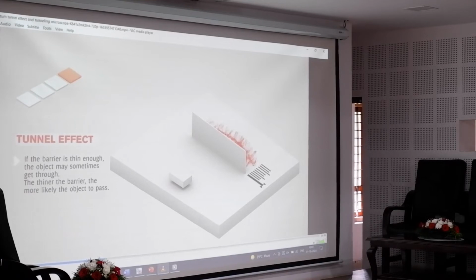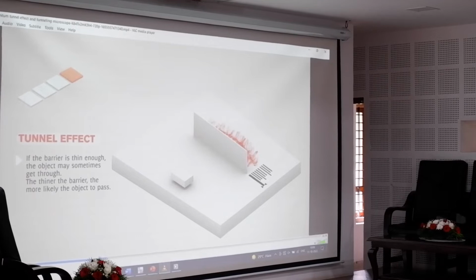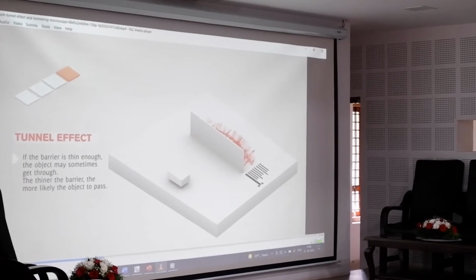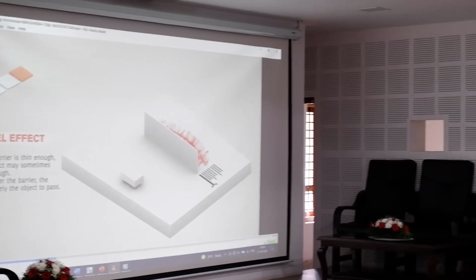Now, in STM, what is the barrier? That is basically the air gap. Which means that I have a tip, I have a surface. If I bring the tip closer and closer to the surface, what happens? The probability of electron jumping from tip to the surface or back, depending upon the polarity of the voltage, will exponentially increase. Okay. I am just going to show you 2 to 3 slides on the theory of tunneling, which you already know, just to refresh.